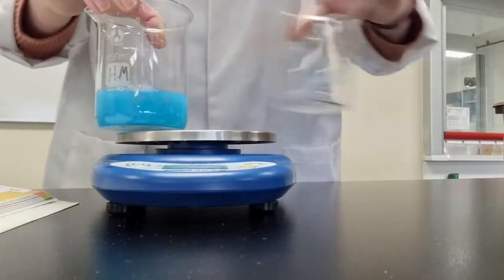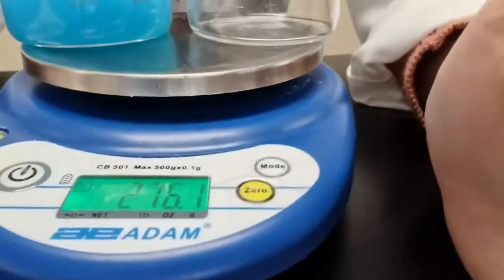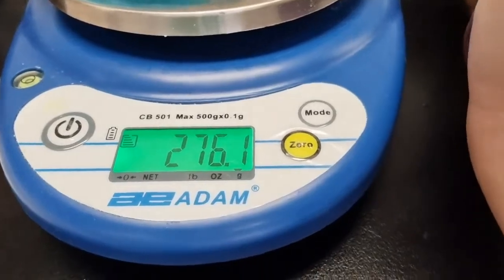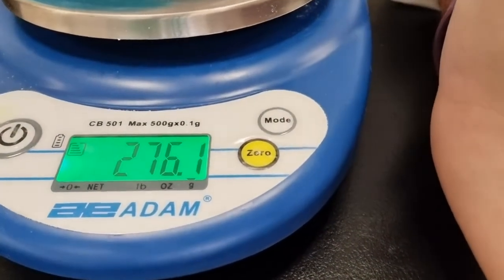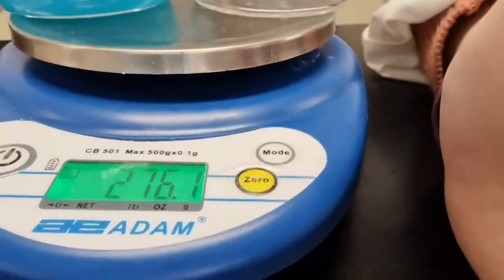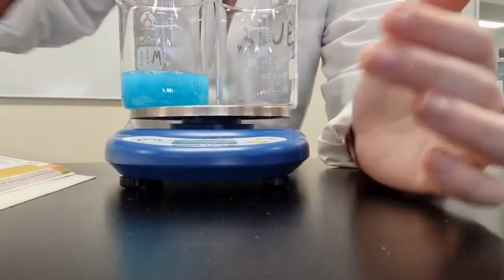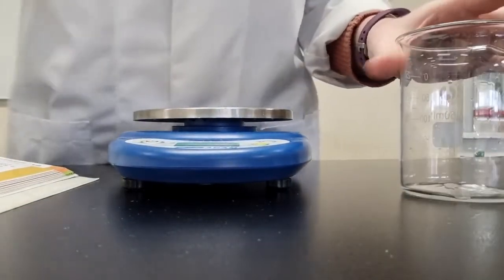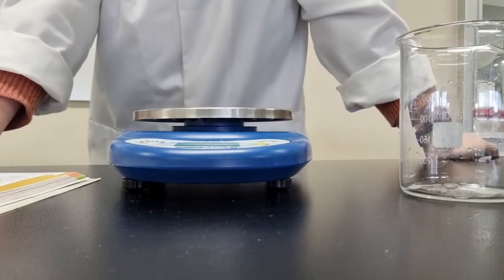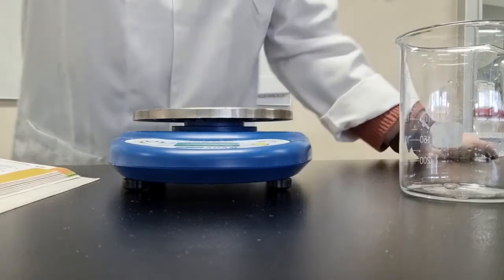I'm going to re-weigh them. They're both my beakers and a solution. What have we got? 276.1. So again, about the same. So write your observation and those masses there as well. Where am I up to? I think I'm done.